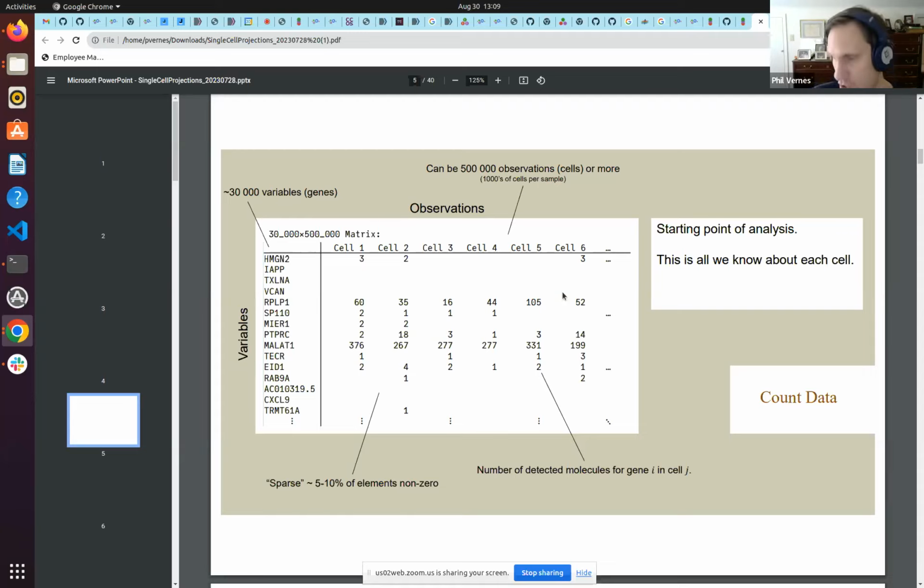And part of the advantage here is by computing things differently, whether it's a dense matrix or a product of matrices, by discriminating on the type of matrix or matrix expression or sub-expression that we're looking at, we will do different things. This is where the multiple dispatch and high performance comes from in Julia.